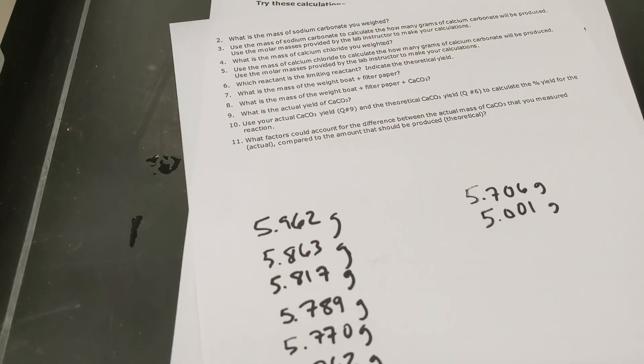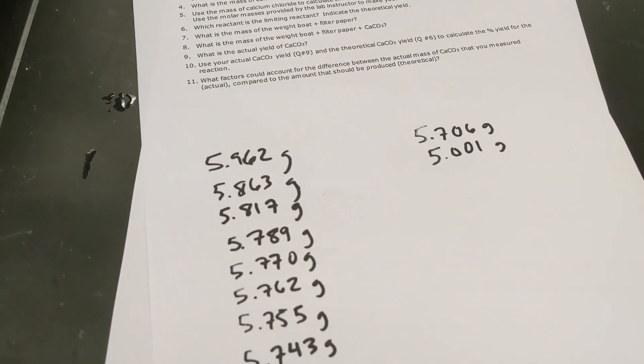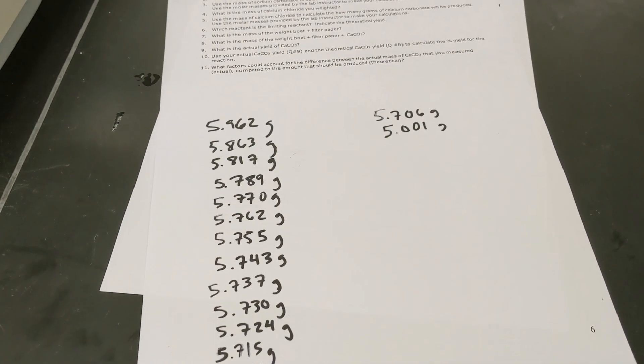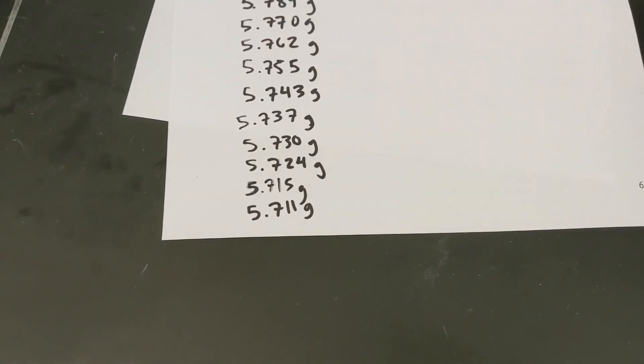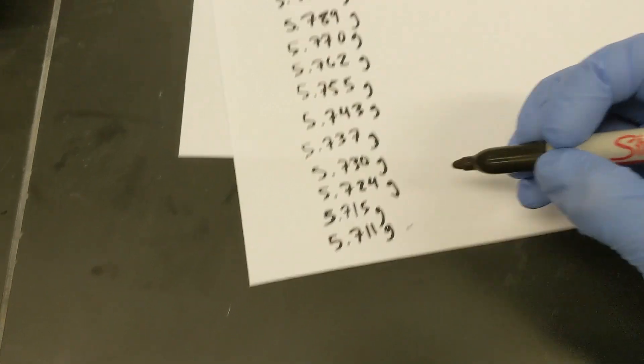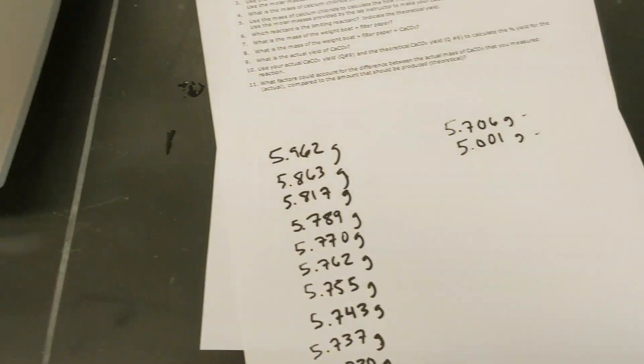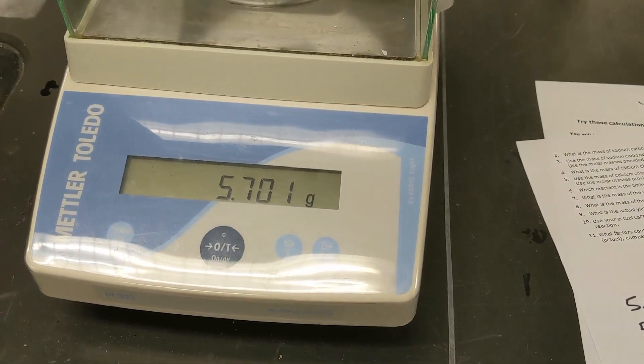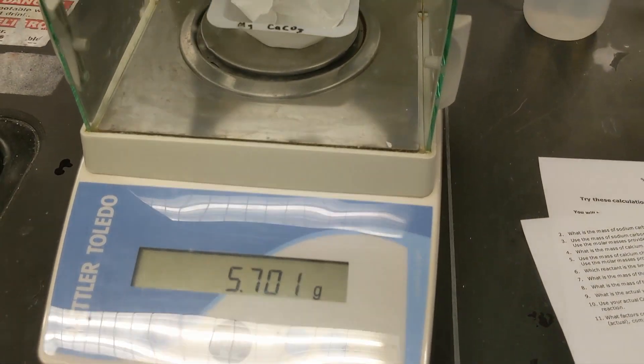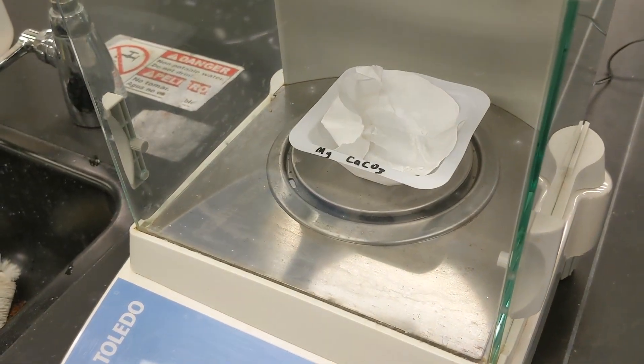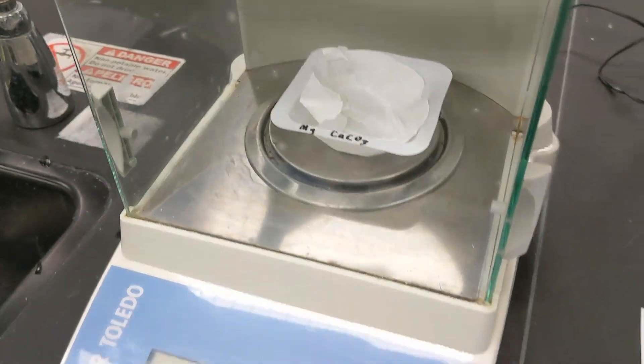So as you can see I've spent like the last 10 minutes just getting weights, by microwaving and re-weighing my precipitant with my weigh boat. And as you can see here, these last three, this one, this one, and this one, are all 0.005 from each other. So that is our final weight of our precipitant in the filter which is on that weigh boat there.